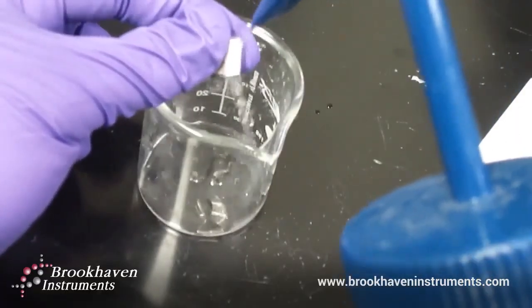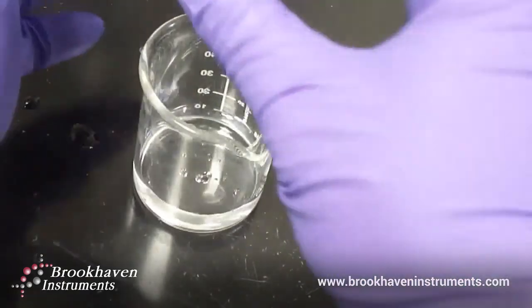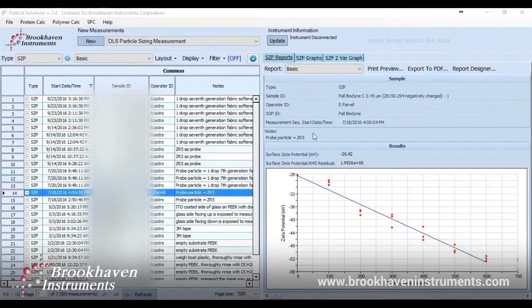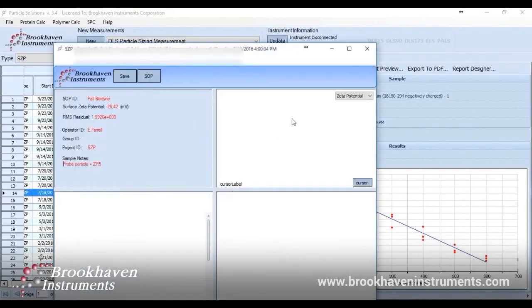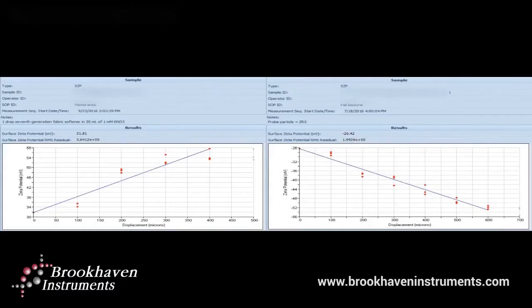To prepare for another measurement of a different sample, just rinse the electrode assembly thoroughly and remove the substrate and adhesive and also rinse thoroughly. Then proceed with the original steps for sample mounting. We have a negatively charged membrane from the same supplier, and completing this measurement sequence, we can see a surface zeta potential of negative 26.42 millivolts with good repeatability at each displacement. As you can see, the membranes show an excellent linear fit to give you the surface charge for each of these membranes.